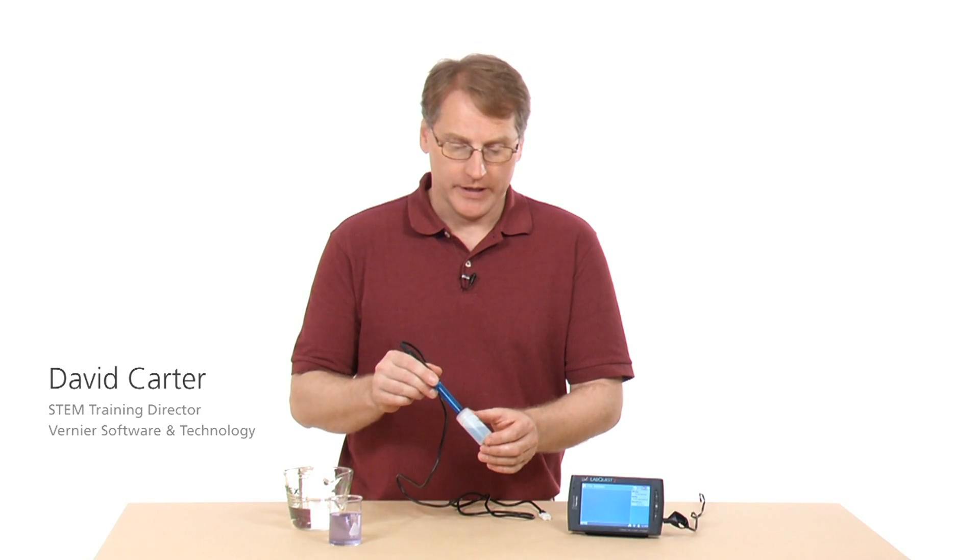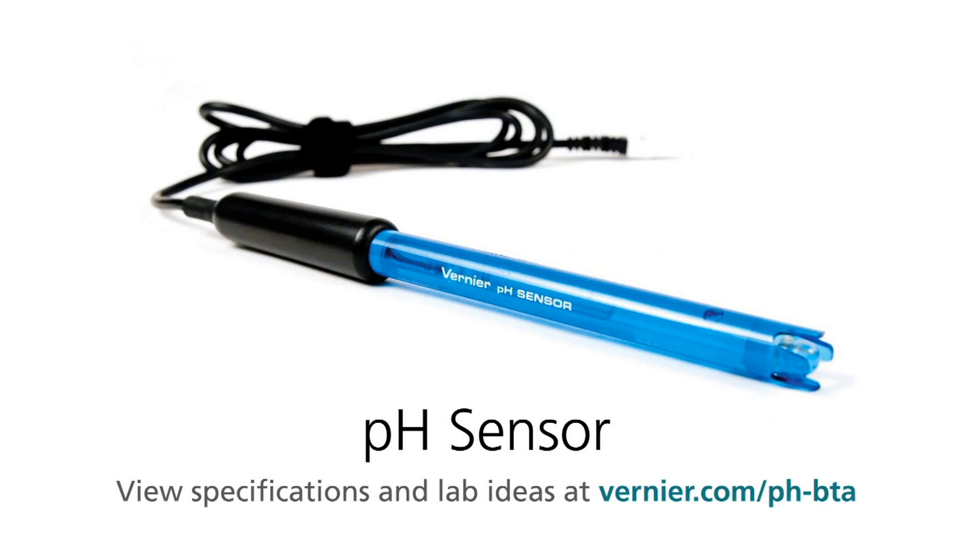This is the pH sensor. It's used in quite a few of our books - chemistry, physical science, middle school, biology - so it's used across the curriculum.